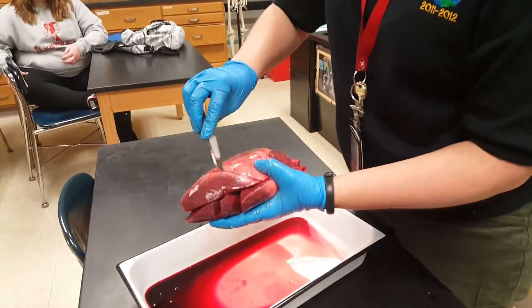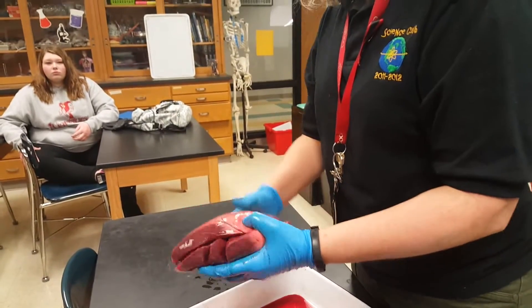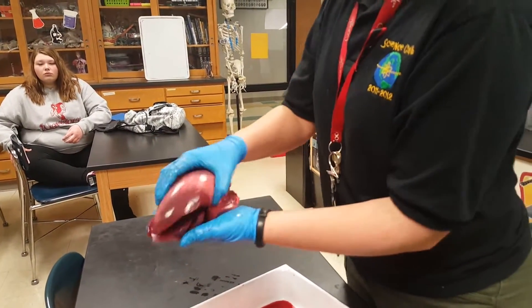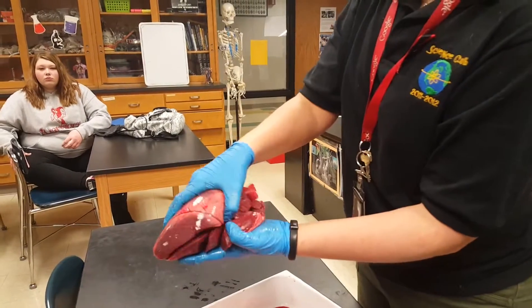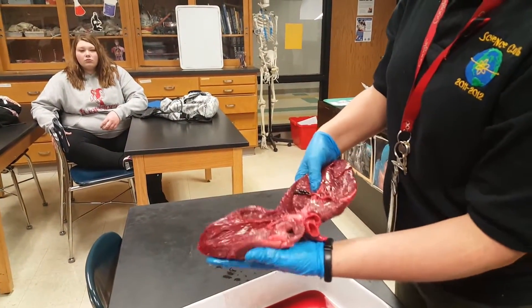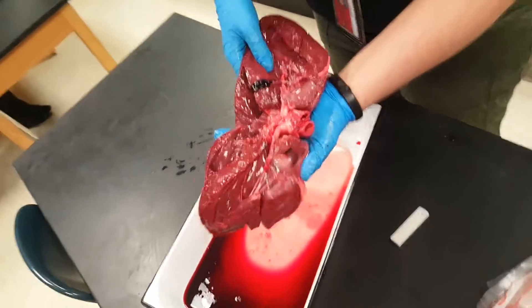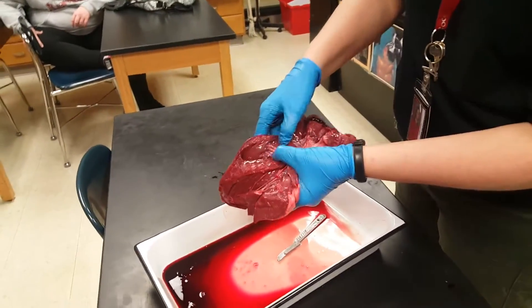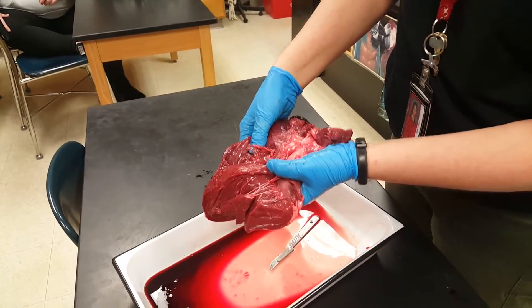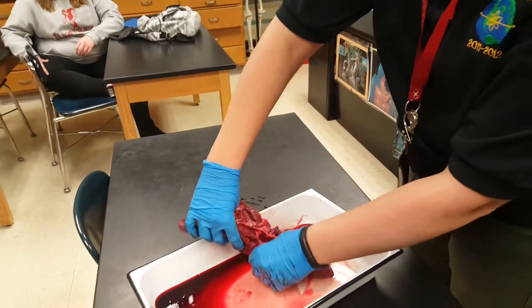Also, you can see easily on this heart — not so much on the preserved one — what's that right there? It's a coronary artery. So, front of the heart: this is the left side over towards Sarah, and here's the right side. So there we see the chordae tendinae again, and the valve on the right side of the heart would be the tricuspid.